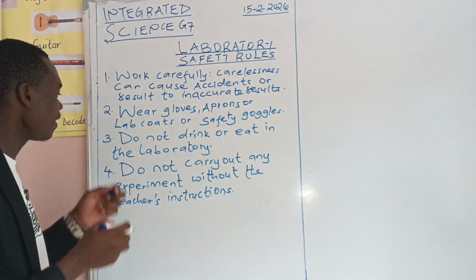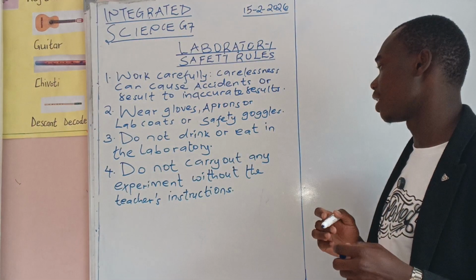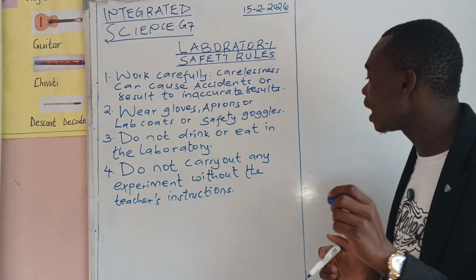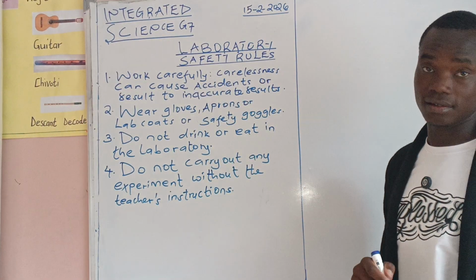Very good. Another very important rule you need to put into consideration is that you are not supposed to carry out any experiment without the teacher's instruction.